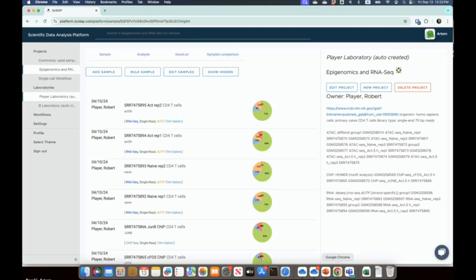Is there a strong reason that you went with CWL? I assume they're all fairly similar in what they support. So I think they're similar, but CWL has a more detailed and standardized description, and we need a more standardized description for creation of our pipelines. If you're going to have a standardized workflow language, it probably should be standardized. Yeah. Okay. Thanks. Okay, so this is the actual interface.